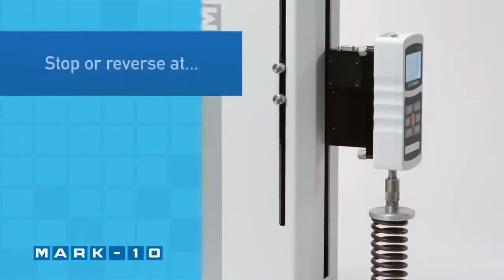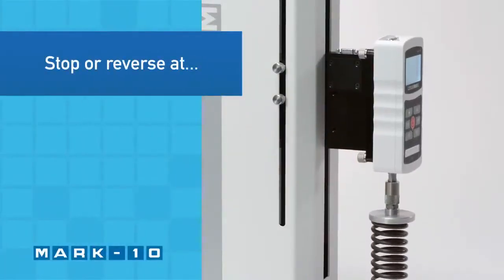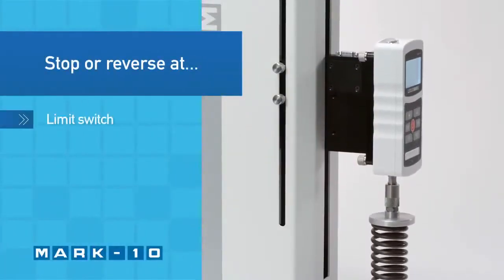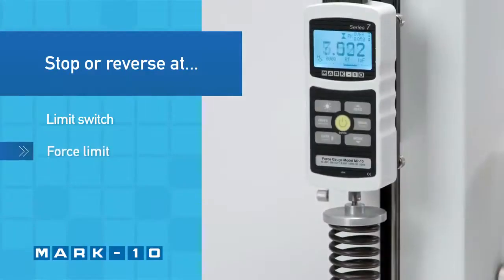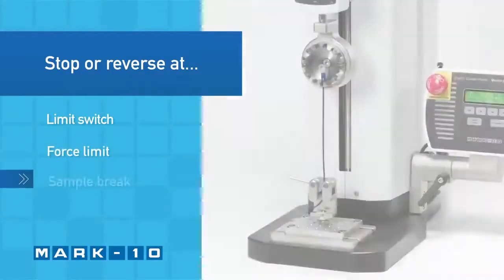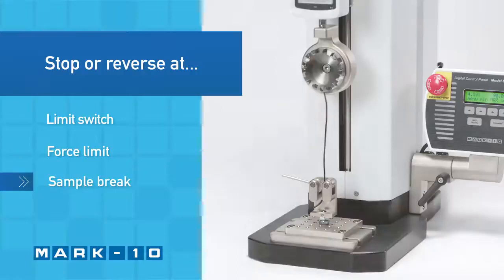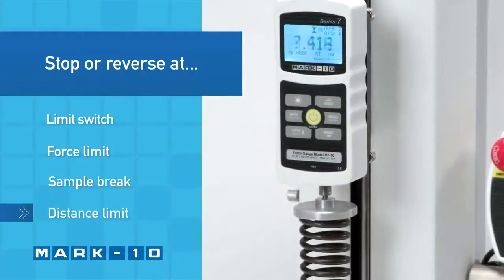The test stand can be configured to automatically reverse or cycle between limit switches, when reaching a force, when the sample has broken, or when a distance limit has been reached.